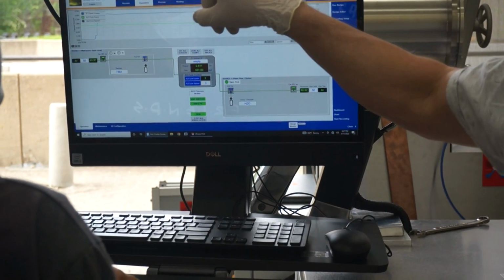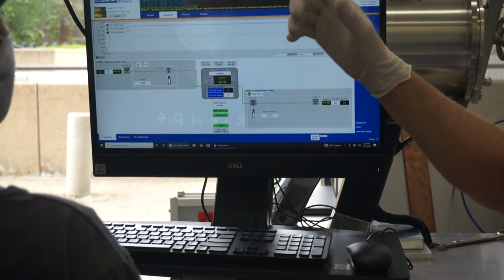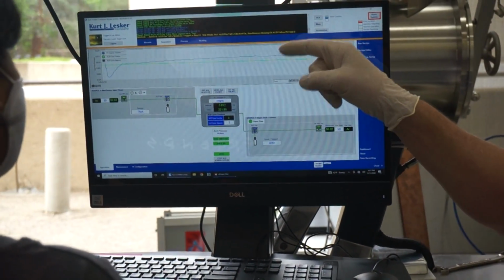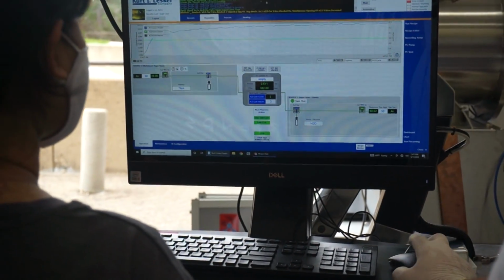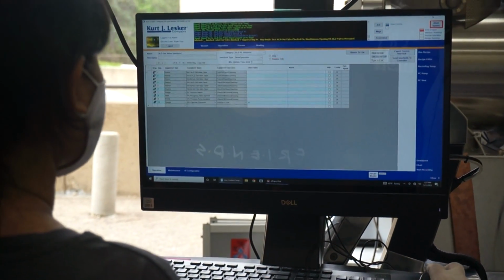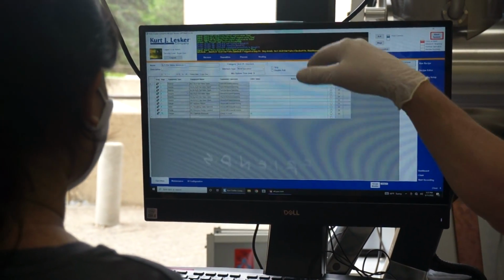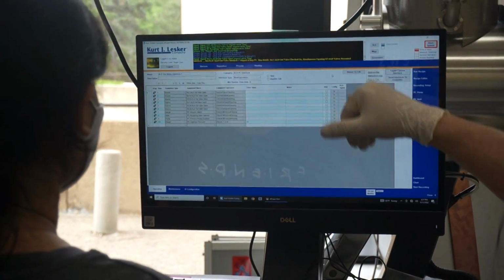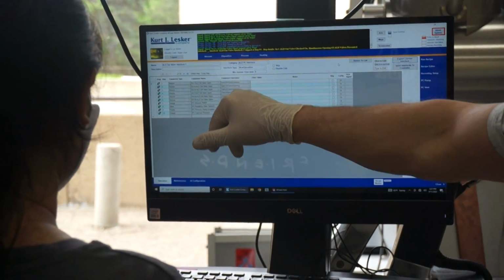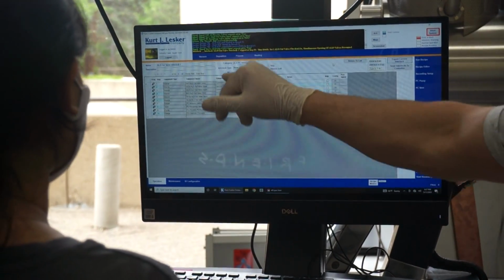What happens if you get an interlock? First of all, read it, see if you can make sense out of it. If you want to find out what that interlock is saying, then you can double click on the interlock and it'll bring you to the interlock list. And this will be in some sort of logic step most of the time. In this case, it's 4. And it says, don't allow one valve to be open if other valves are open. That's what this is saying.